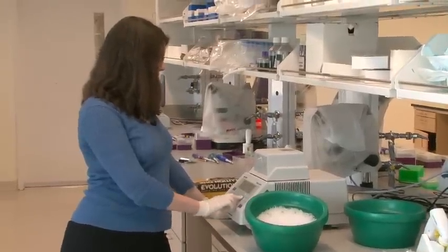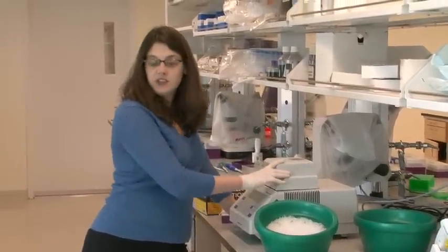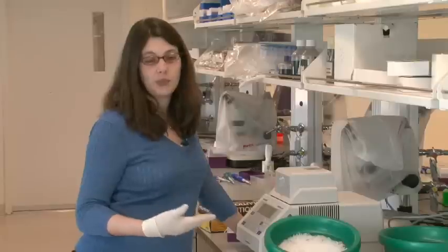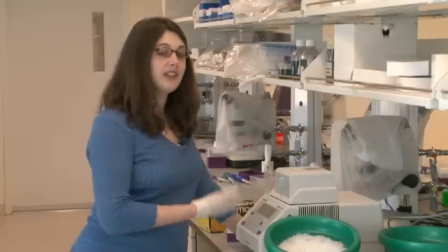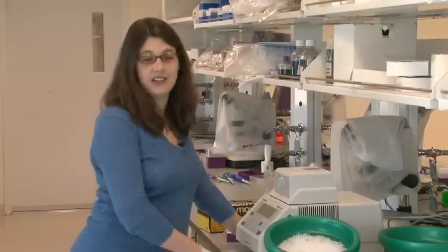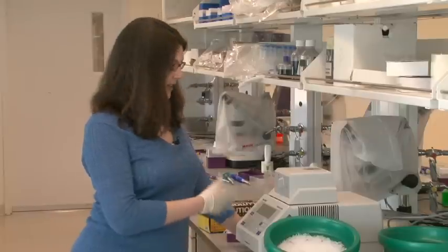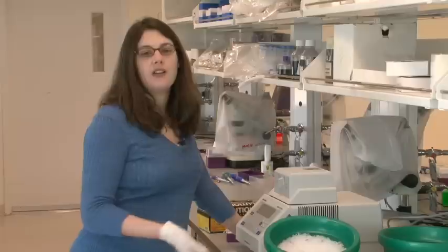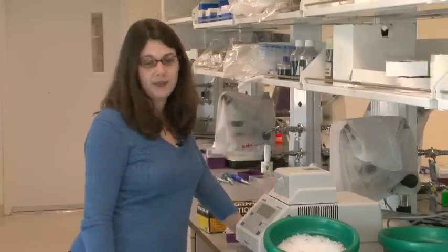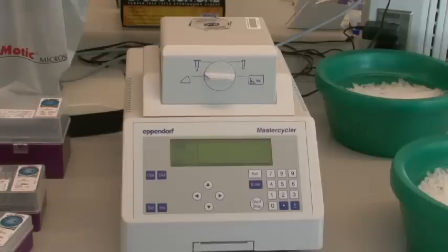What the program is actually going to do is that this machine, although it's called a PCR machine, all it really is is a heating block. This machine is a heat block that changes temperature really rapidly. So it's going to change temperatures, and each step of the copying reaction happens at a different ideal temperature. So as it changes the temperatures, then the steps of the copying reaction can occur in the order in which you want them to.